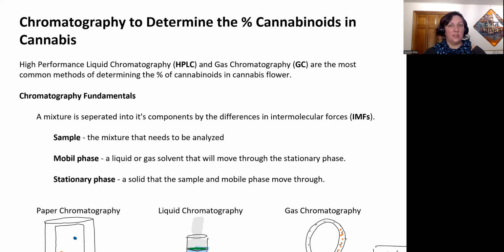But first, I want to give us some chromatography fundamentals. This will be helpful for our lab this week as well as we do a chromatography experiment.